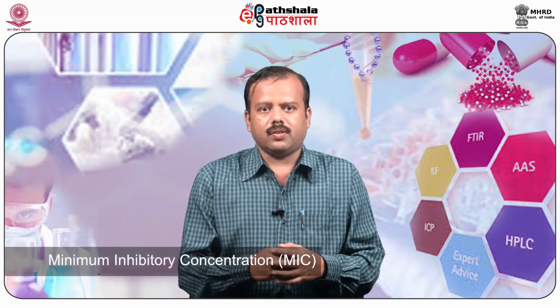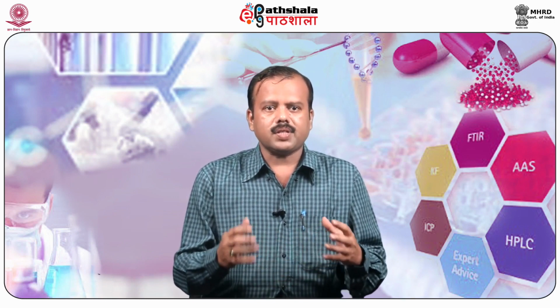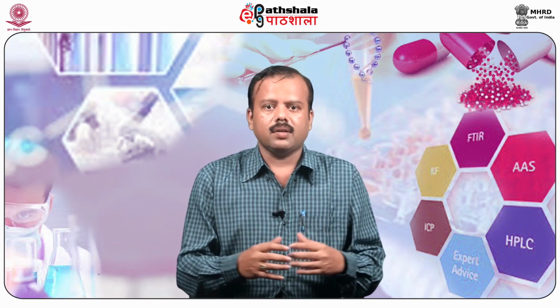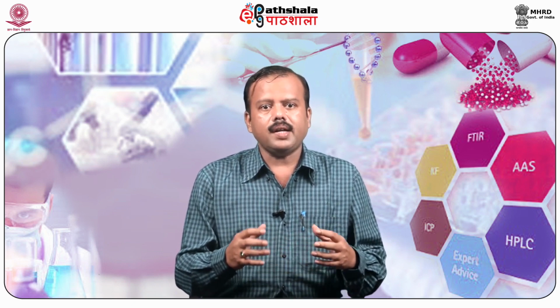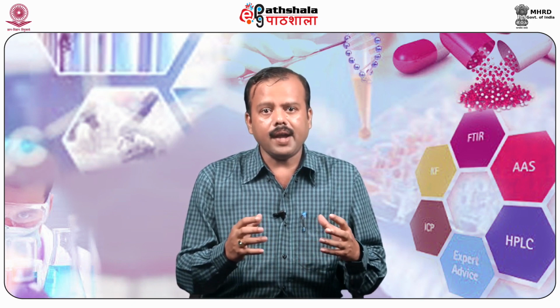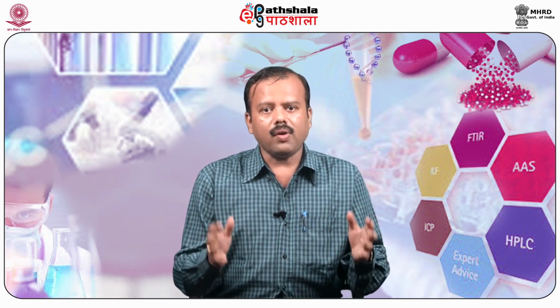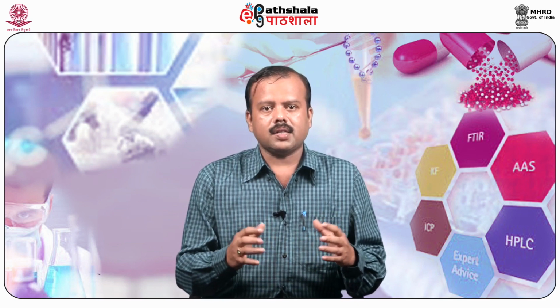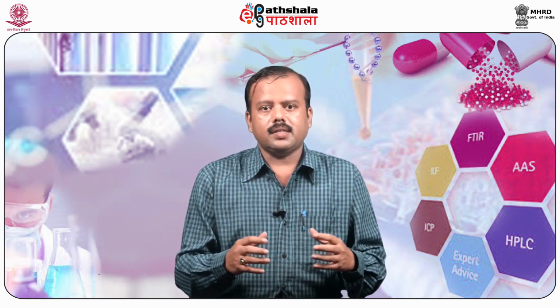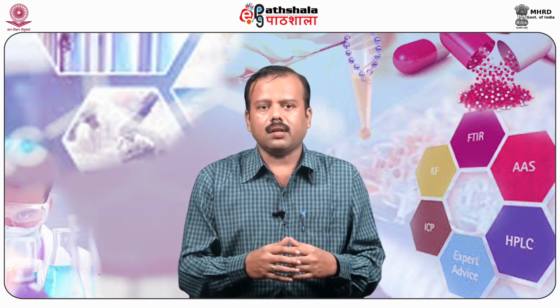Minimum inhibitory concentration, commonly known as MIC, gives the bacteriostatic value of a test substance or test antimicrobial. The MIC of an antibacterial or antimicrobial agent for a particular microorganism is the minimum or lowest concentration that just prevents the growth of that microorganism. The MIC of a test material is determined by the liquid dilution method or by the solid dilution method.